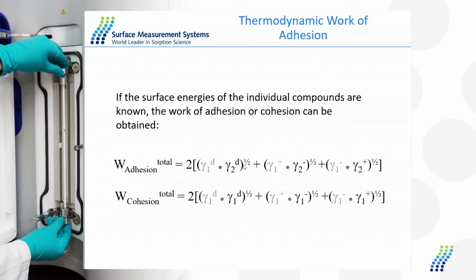So if you're thinking about a powder blend, it's very often a balance between cohesive forces and adhesive forces. So that's why we look at the cohesive forces, which is based off the surface energy of just the one material. Let's say that's a carbon nanotube, and we want to put it into some other material, starch. I'm just making up things here as we go along. But we measure the work of cohesion of the nanomaterial, and then we might compare that to the work of adhesion of the filler material with the matrix material.